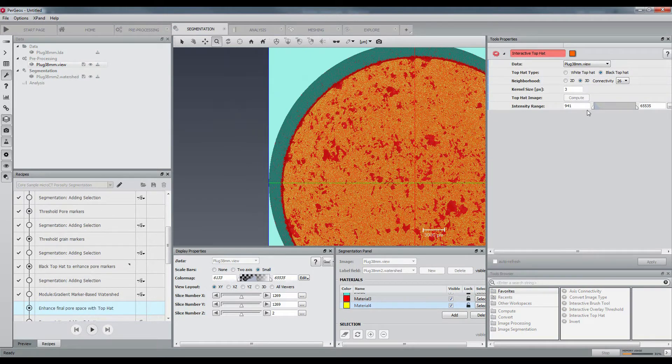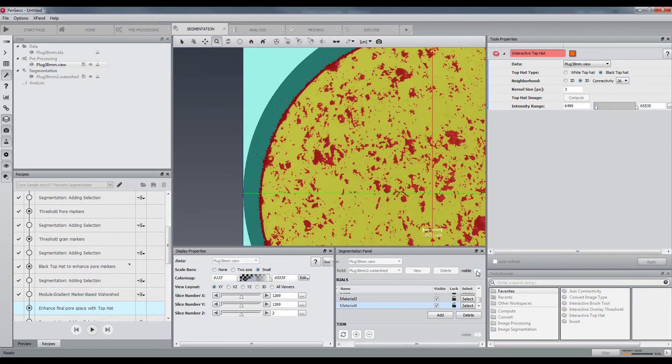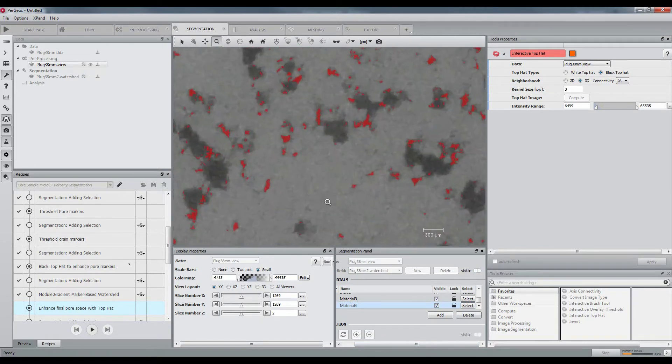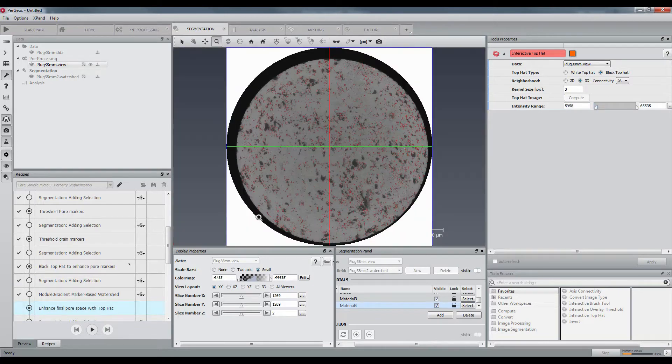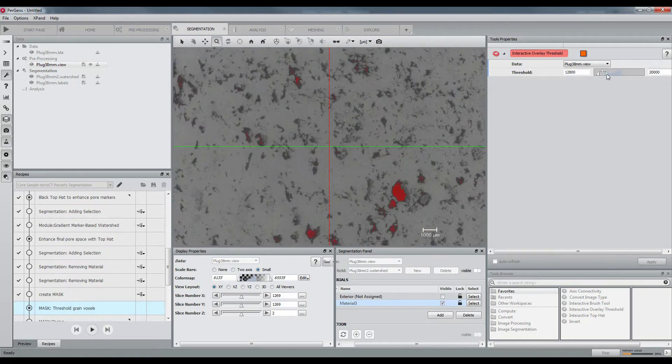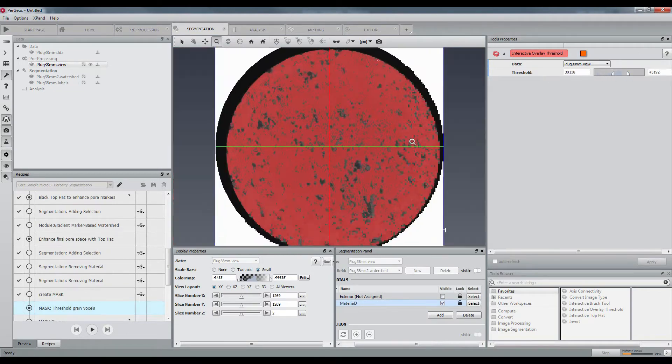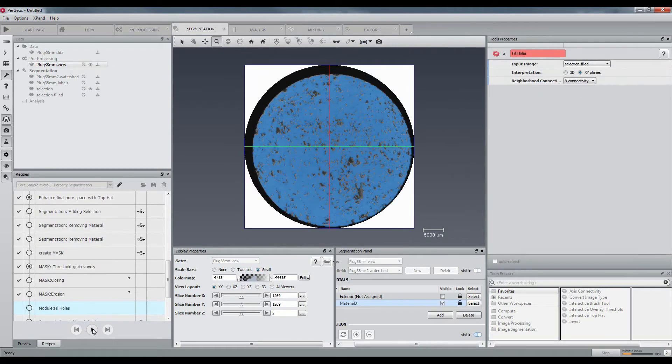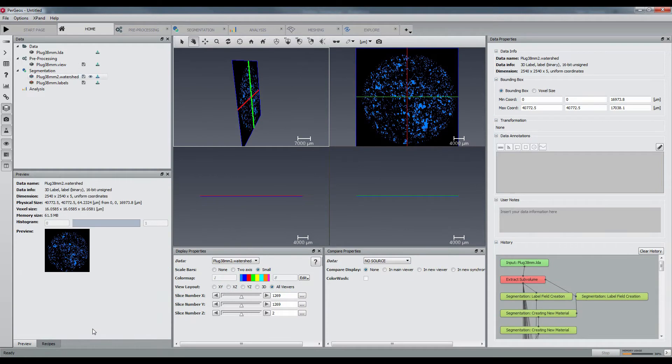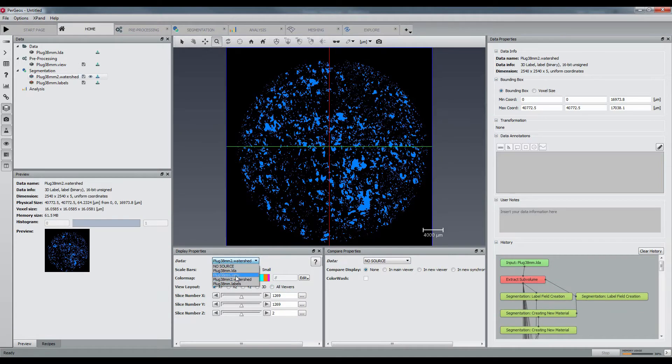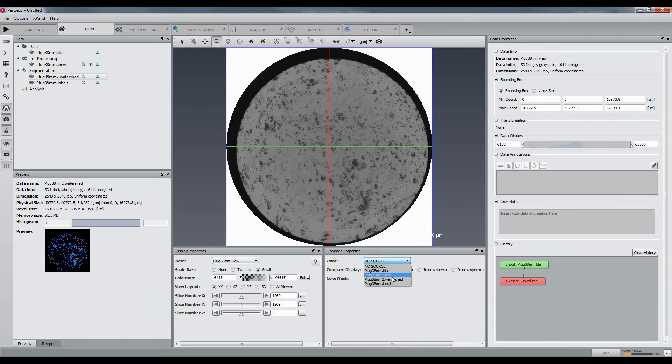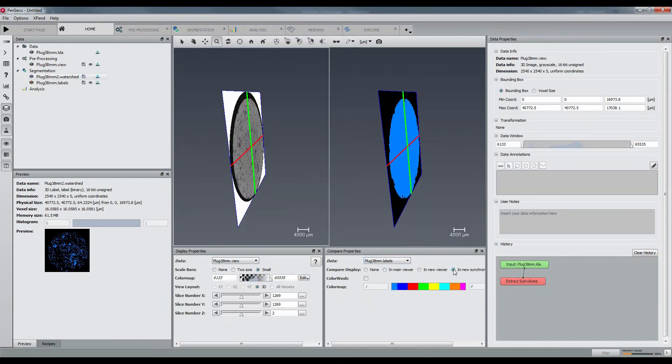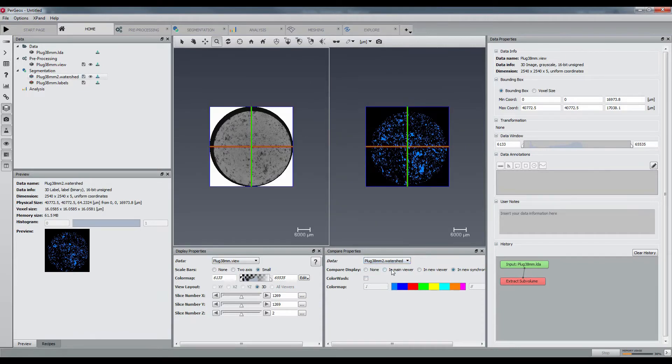It is often useful to hide the labels in the segmentation panel when adjusting a selection. Now the cylindrical mask will be computed just by indicating the dense region. We now have the pore space of the few slices that we can visualize with the compare panel.